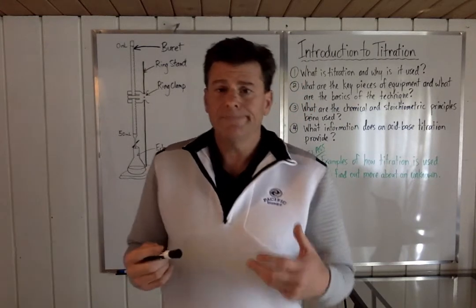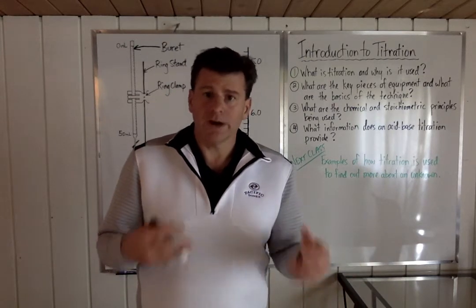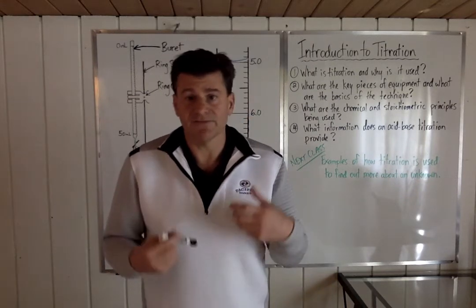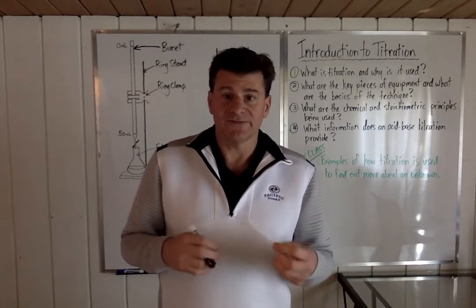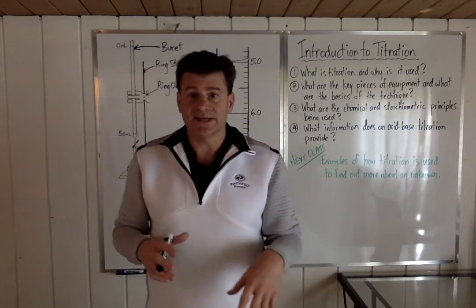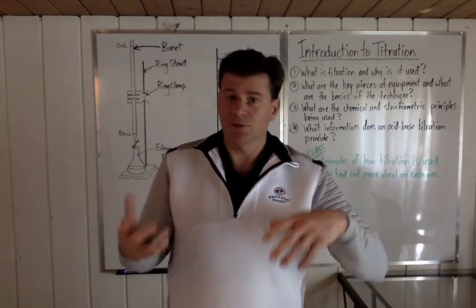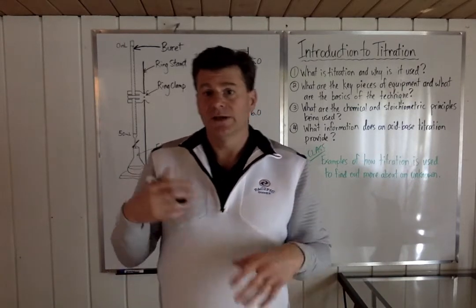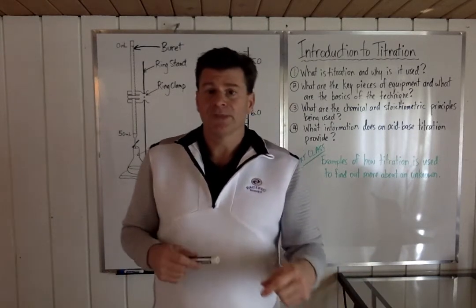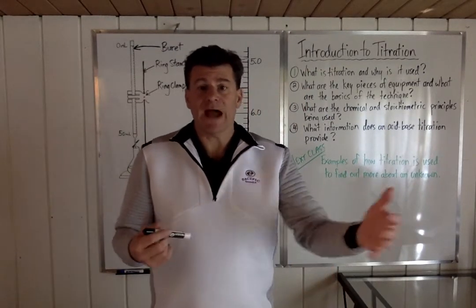Okay, so titration. Today's going to be primarily a qualitative class. It's not going to be a lot of quantitative things, even though, really, titration is a very quantitative thing. We're going to get into the big picture ideas of titration, what it is in general, some of the principles, some of the equipment that you're going to see, how you set it up, how you do it, some of the measurement subtleties that you have to be aware of before we actually get into the doing the math part of it all.